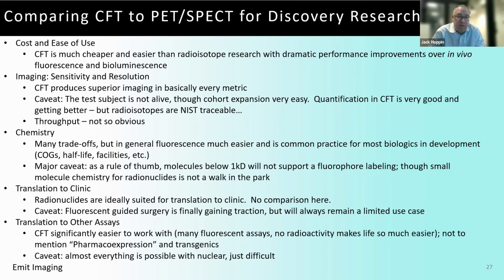On the flip side, for translation to the clinic, let's be clear, radionuclides are perfectly suited to translate to the clinic, and there's really no comparison here. There's a movement in fluorescent guided surgery, and we have had a lot of conversations about it: injecting a fluorophore, then resecting a tumor and studying it. But let's be open here. Radionuclides are the best translational molecular imaging modality, and always will be.